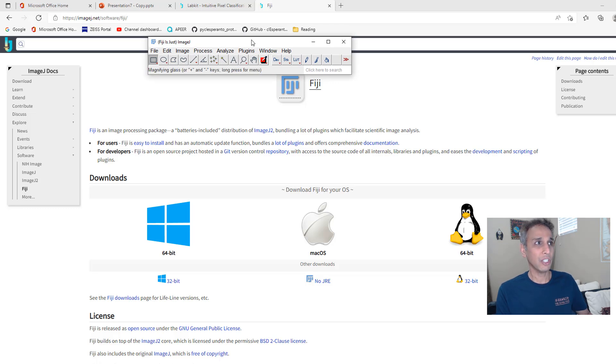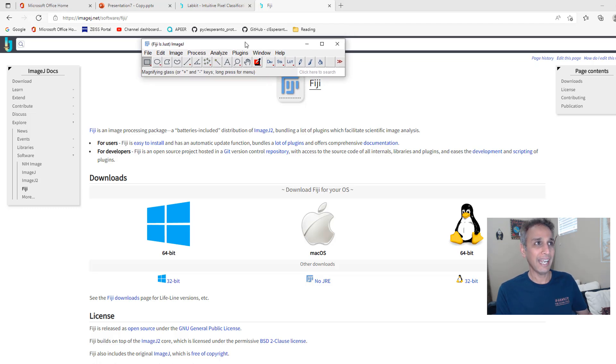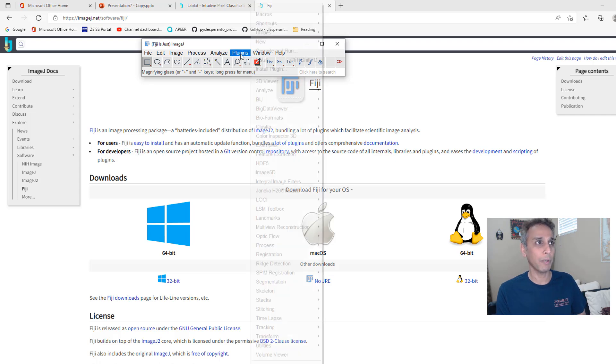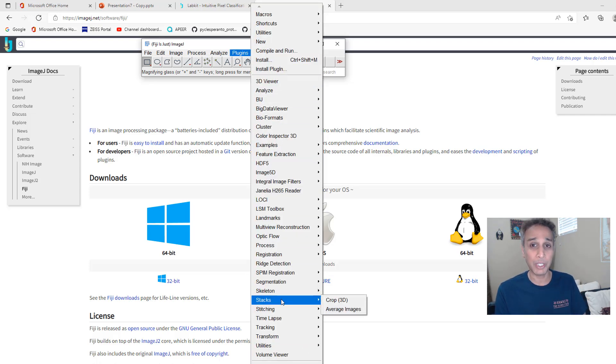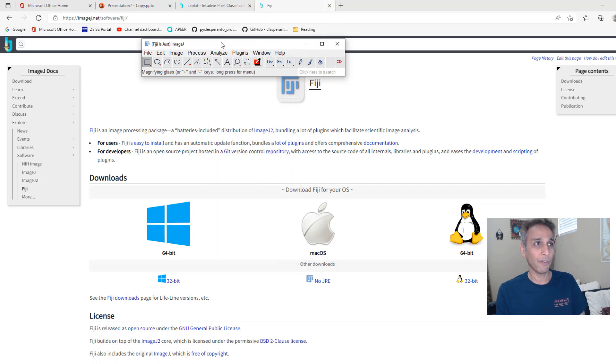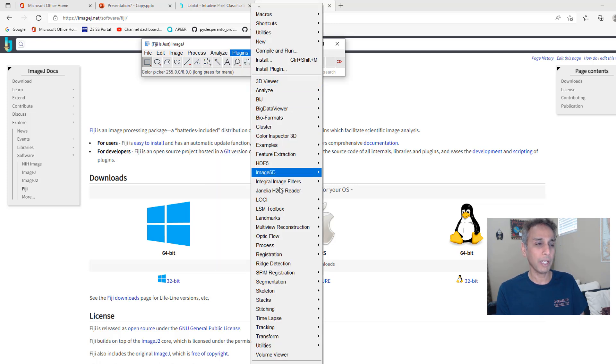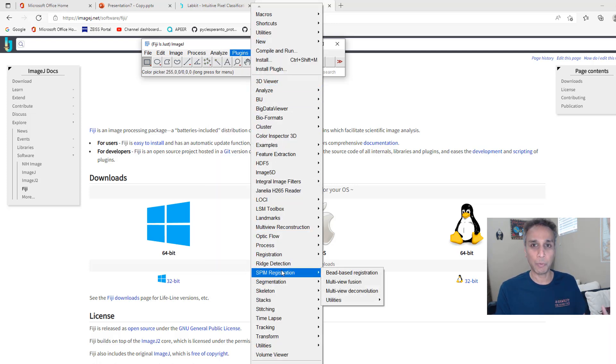This is it. This is your ImageJ and if you have downloaded it from the ImageJ site, when you go to plugins, you may not see all of these plugins, maybe a subset of these.